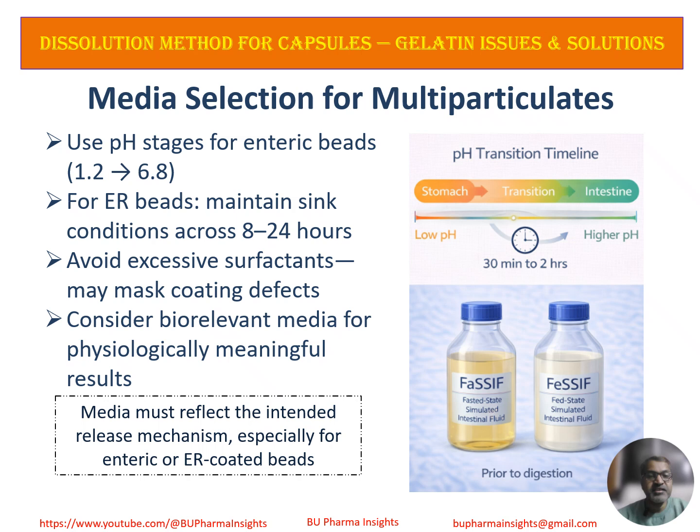For extended release pellets, long duration testing is critical, often 8 to 24 hours. You must maintain sink conditions throughout the test. Always confirm drug stability in the medium.